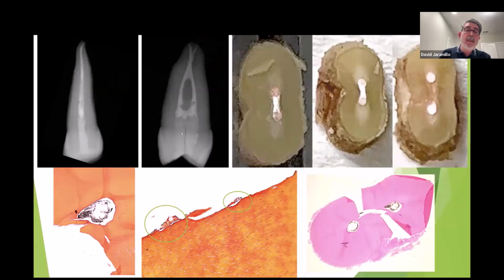But unfortunately, the patient came back to the office 3 months later with severe pain. So the tooth was extracted. The tooth was sent to me. Here I resected the tooth to do the histological section. And in the coronal portion, where there is more contamination, we can see a lot of bacteria, not necrotic pulp tissue, I'm sorry, this is contamination inside the crack.